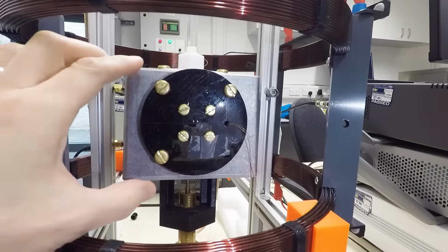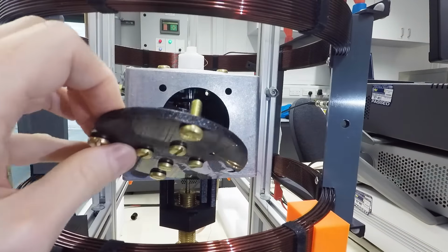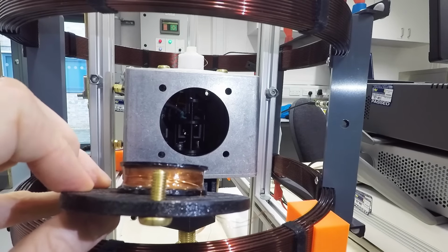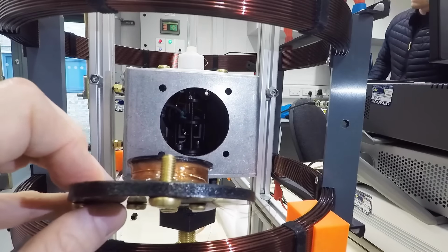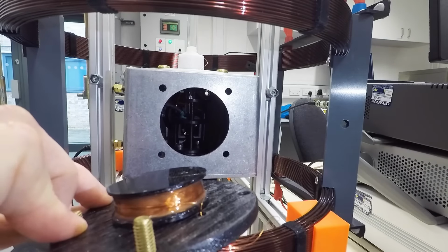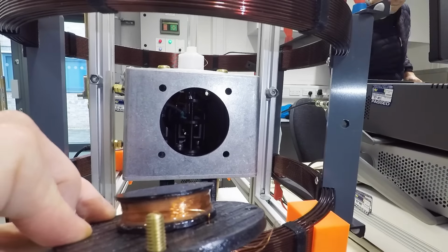So if we open up this central cage, which is an aluminium box, we can see that we have our modulation coils in there and the platform which supports the movement of the coupling loop with respect to the resonator. And we have modulation coils set on the top and bottom and on the sides so that we can run this apparatus in parallel or perpendicular mode with respect to the main magnetic field B0. Now fortunately we can show you what goes on inside the spectrometer in a bit more detail than usual because Eve is currently building one from scratch. So let's have a look at it.